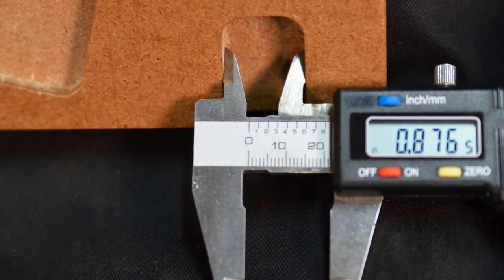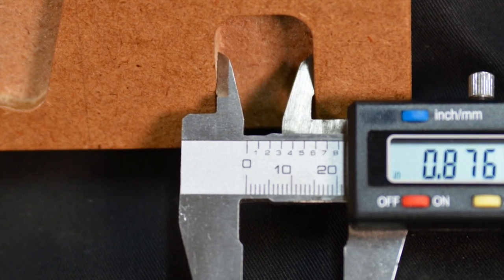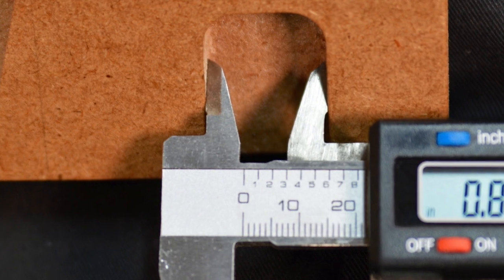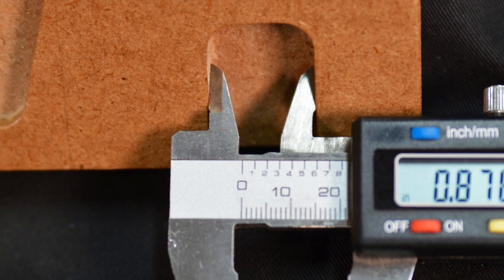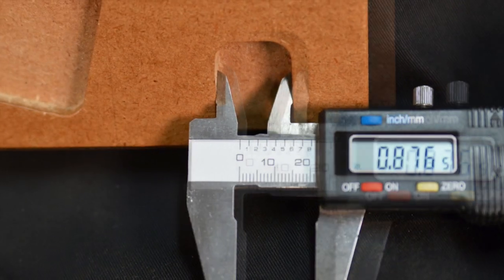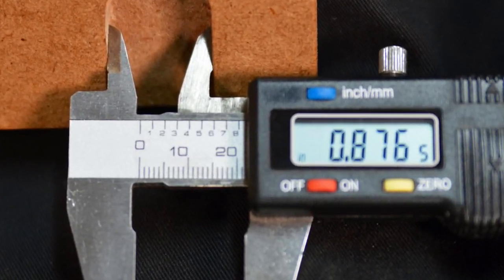To make an internal measurement, slide the jaws closed and place the inside measurement jaws inside the item to measure. Slide the jaws open until they gently contact the item. Read the measurement on the LCD screen.